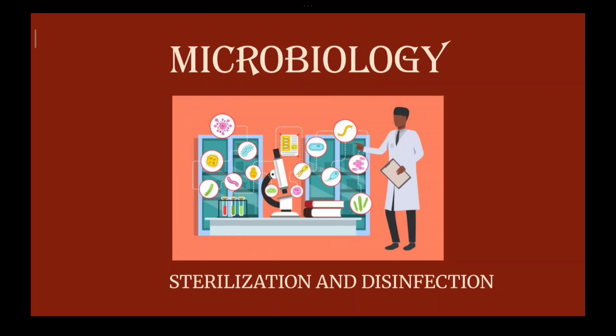The topic for today is from Microbiology: sterilization and disinfection. In today's class, we'll begin our study of sterilization and disinfection, a cornerstone of microbiology and infection control. It's an important topic because without this process, the study of microbiology is very difficult. It plays a very important role while studying the microbes, so it is essential to keep sterilization and disinfection as an important aspect.